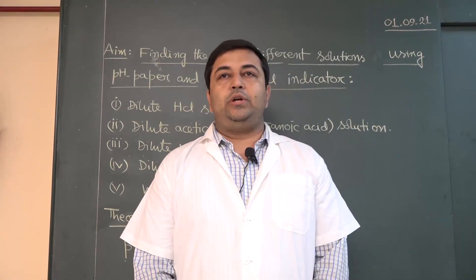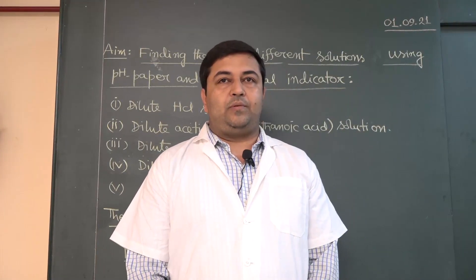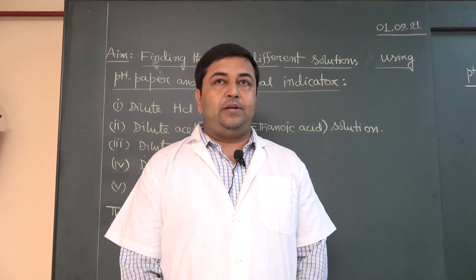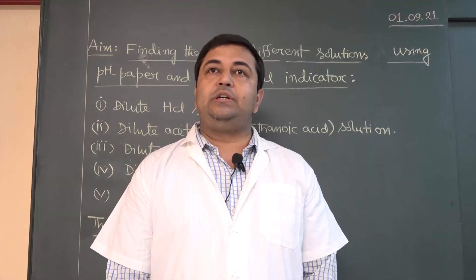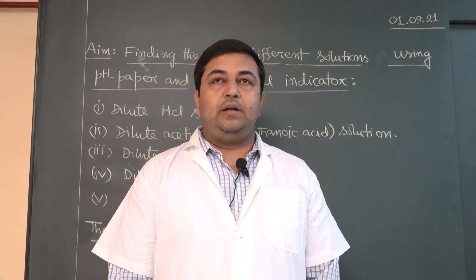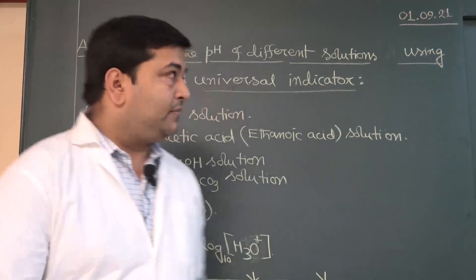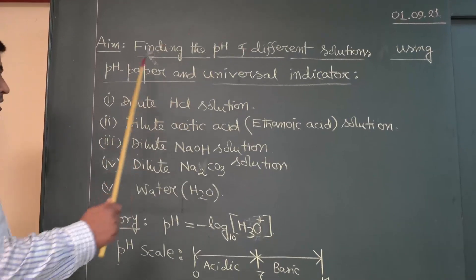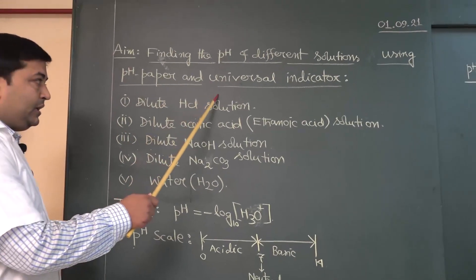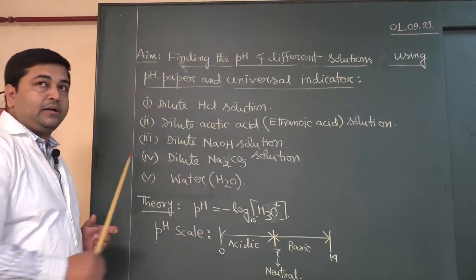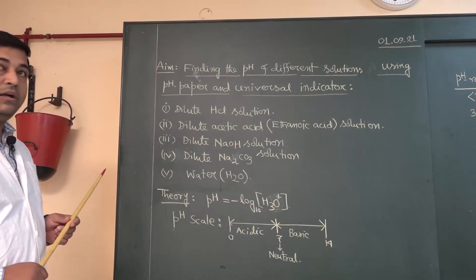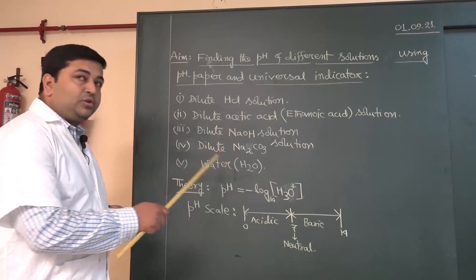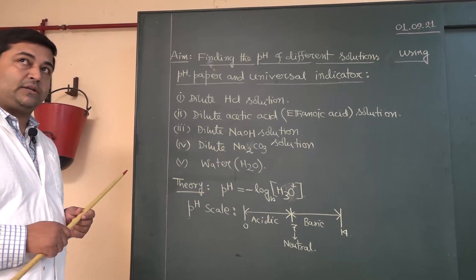Hello students. Today we are going to perform one practical and the name of the practical is finding the pH of different solutions using pH paper and universal indicator. Using pH paper and universal indicator we will check the pH of the following solutions and comment on their nature.